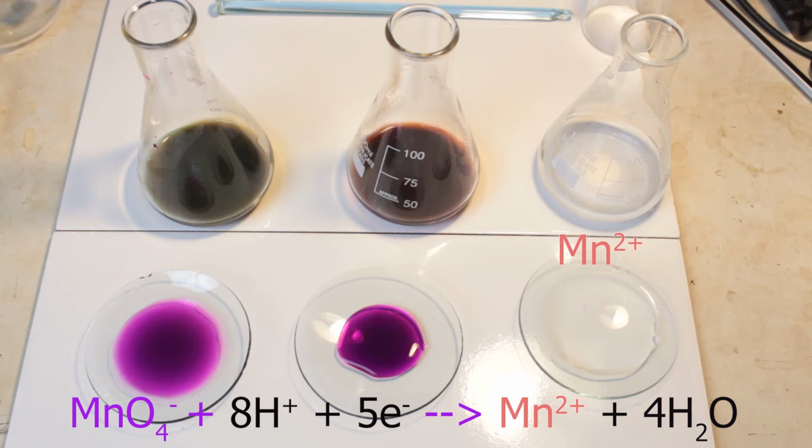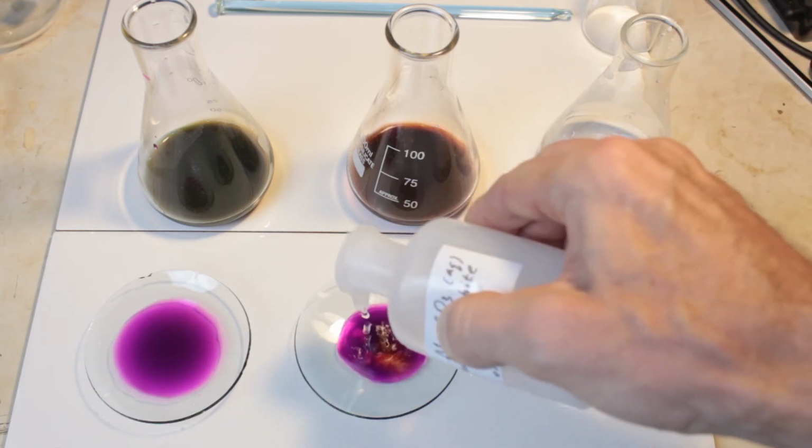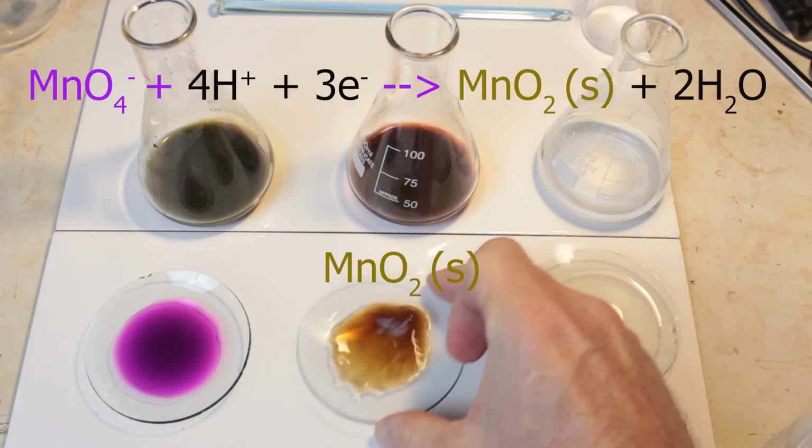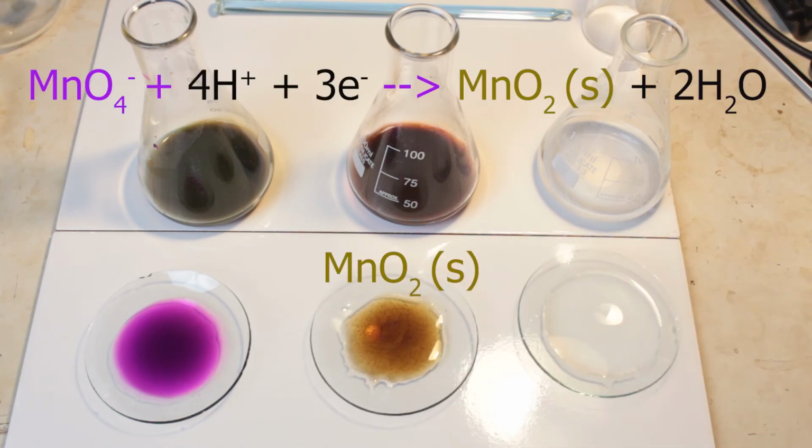Oxidation state is changing from +7 to +2. Okay, here in the middle we don't have enough hydrogen ions, and reduction cannot proceed to completion. So instead of proceeding to +2, it proceeds only to +4 in manganese 4 oxide. And you see hence brown precipitate. Only 3 electrons from +7 to +4. Not enough hydrogen ions, so only 4 per unit.